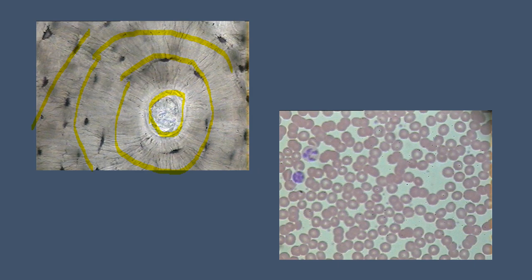And then in the bottom right here, we do have our red blood cells. This is a blood sample, most of it is red blood cells. And then these are examples of some of your white blood cells. They do have a nucleus. That's what the darker purple is. The reason you don't see a nucleus with the red blood cells is because the mature ones do not have one.